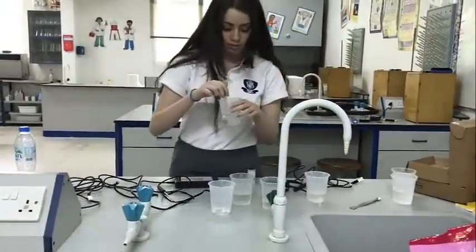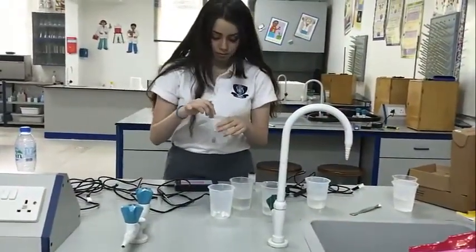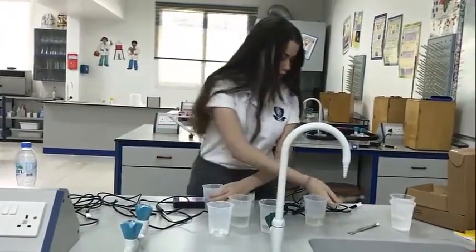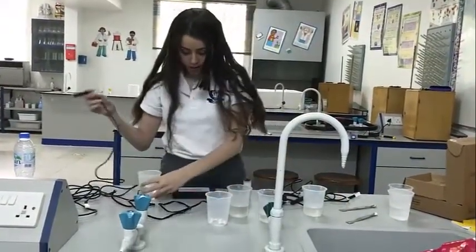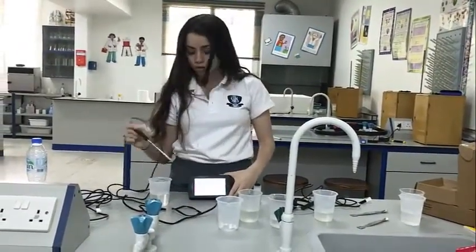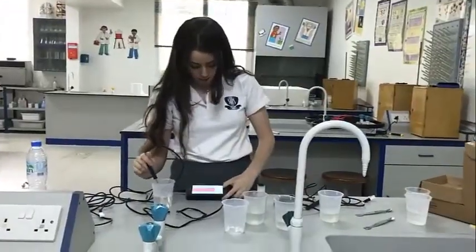And we need to stir. And using the LabQuest temperature sensor, we're going to know if it's an endothermic reaction or an exothermic reaction.